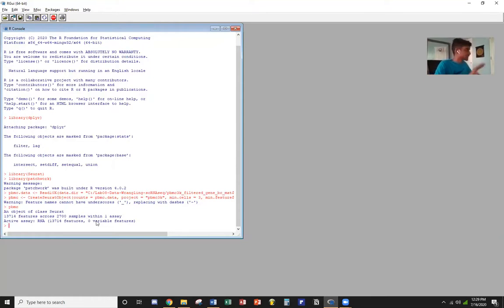Now we'll be examining the first 30 cells. To do that, we know we have the PBMC data, and so we'll be needing to enter in certain genes. You'd want to put these under quotes because this is what the function will be looking for.